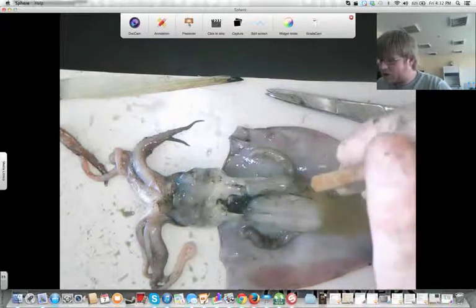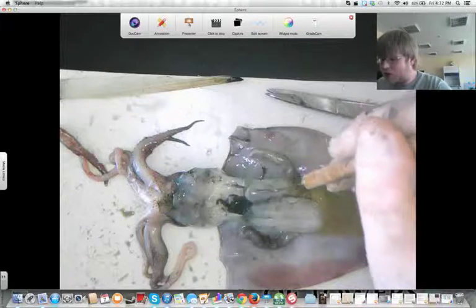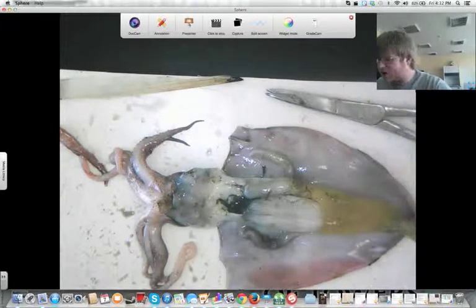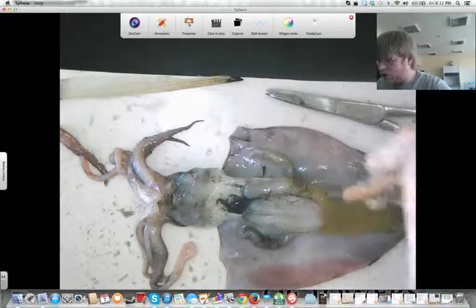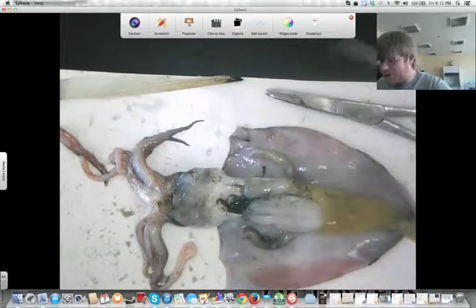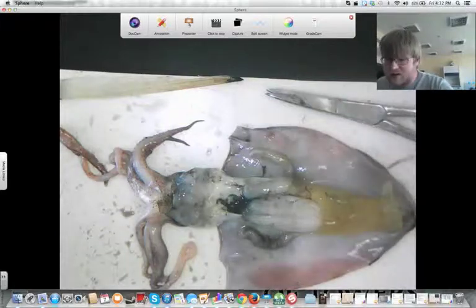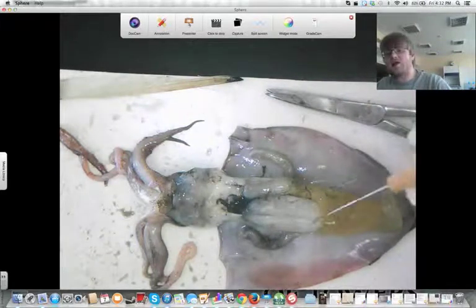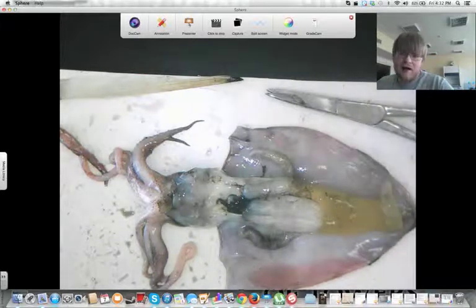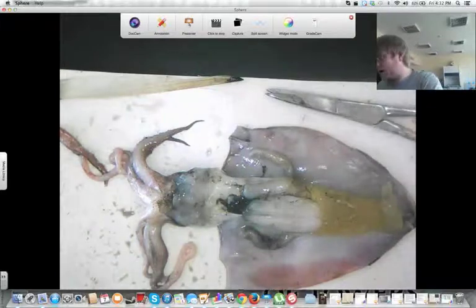Here we have another white organ that looks a bit like a tube. This is the squid's large intestine and anus. So leftover food will exit the digestive tract from that area and be passed out the siphon. Up at the top, we have the caecum, which is like a combination of the squid's small intestine and of its large intestine.